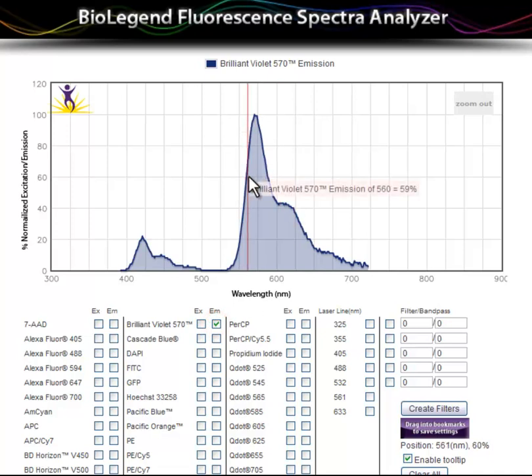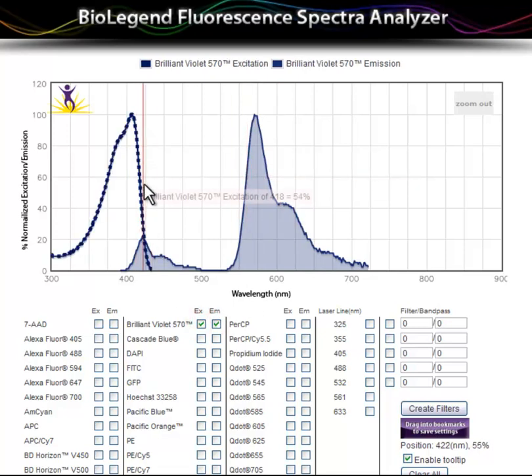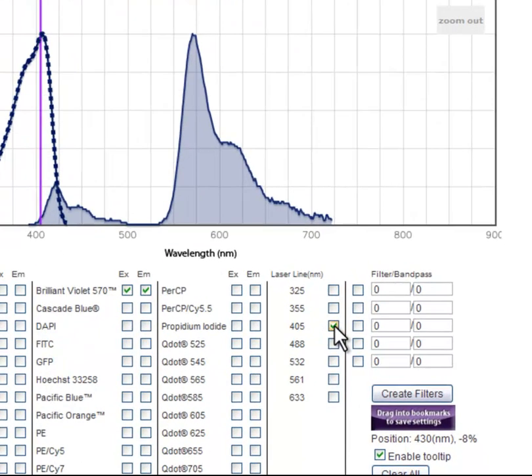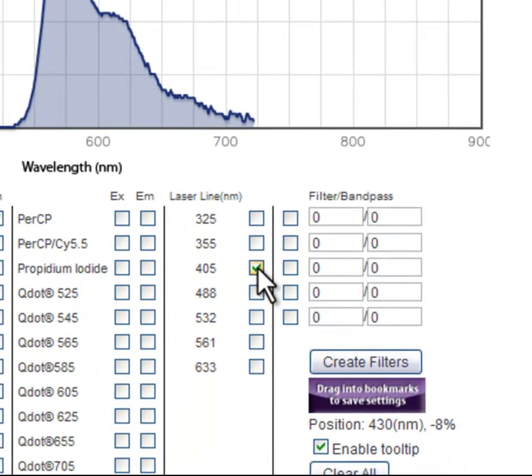Emission spectra are displayed as smooth lines, while excitation spectra are displayed as dotted lines. To view relevant laser lines, check the appropriate boxes.